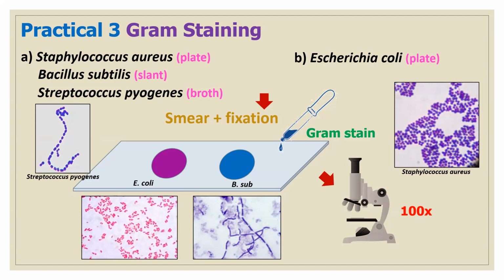Okay, after you take all those bacterial samples, you perform the gram staining, smear, and fixation. For one student, I would like you to do 2 samples on one slide, and also don't forget to label the name of the bacteria on it.